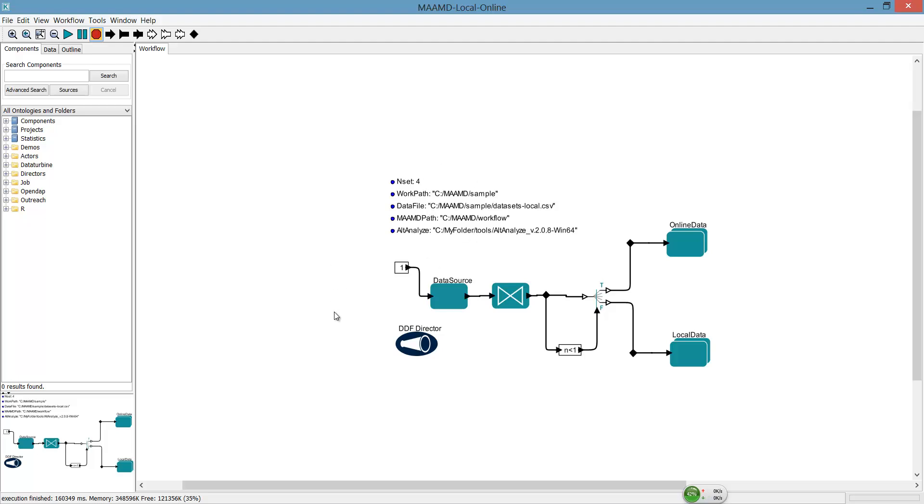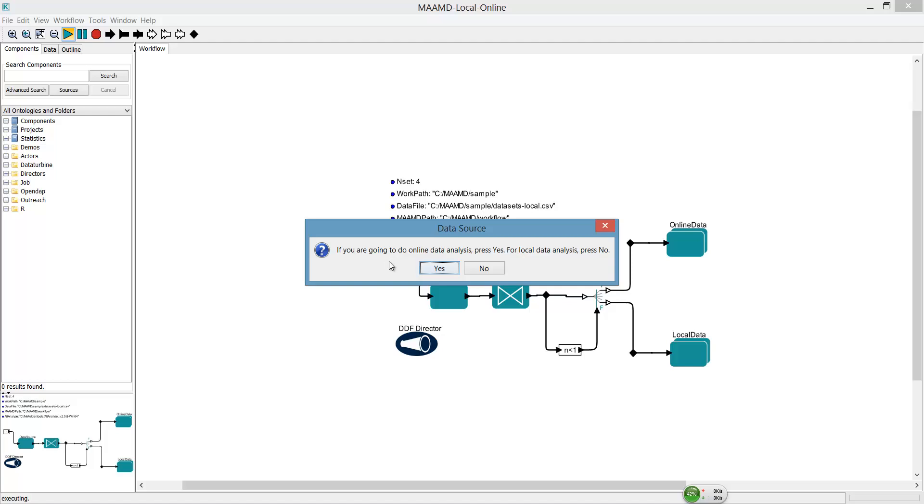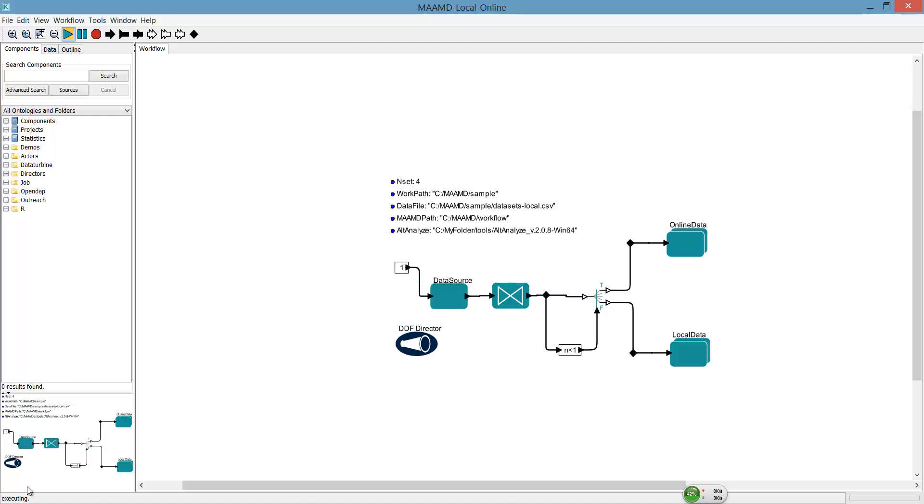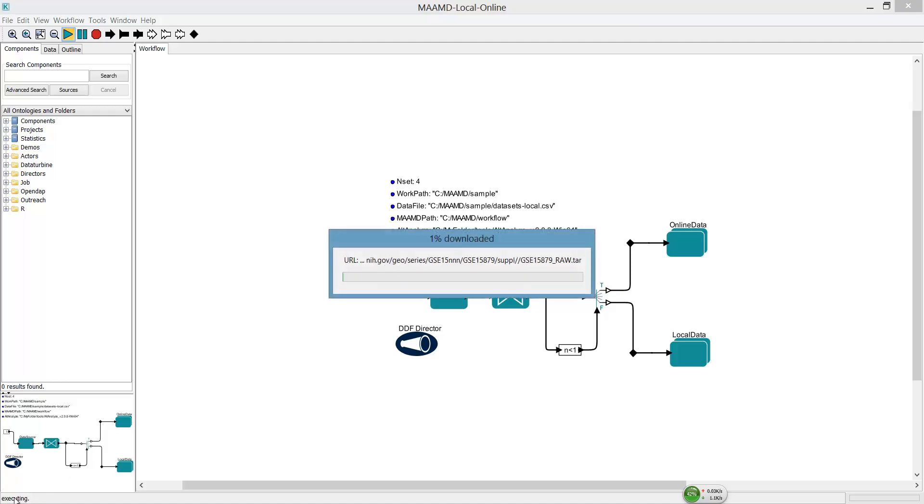Once it's ready, click Run button. Click Yes to analyze online data. Now MAMD will read a prepared input file to download the targeted datasets.